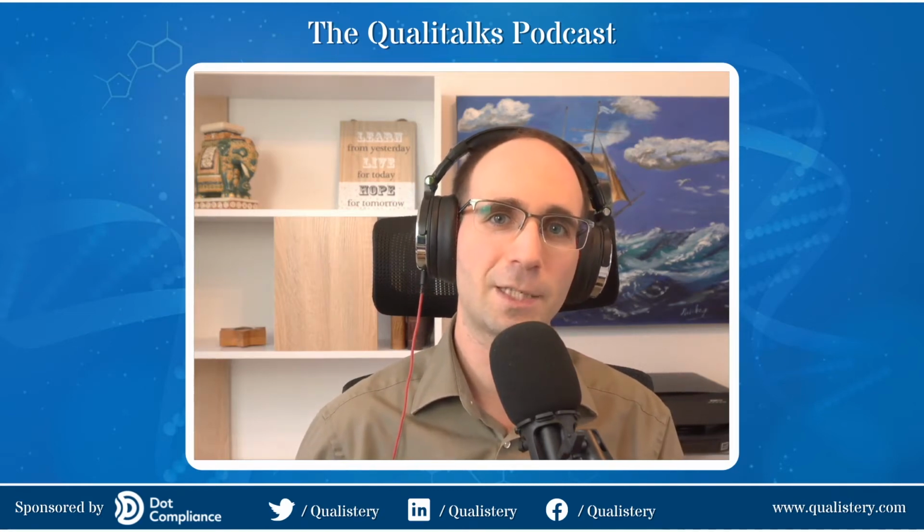I'm Jan Kugler, your host, and my guest today is Chris Maughan. Chris is an expert on sterilization and validation, and we're going to talk to him today about autoclaves. It seems very simple, but issues with this equipment can cost you a lot of time and money. It can set back your production weeks, even months. So it's crucial to avoid it.